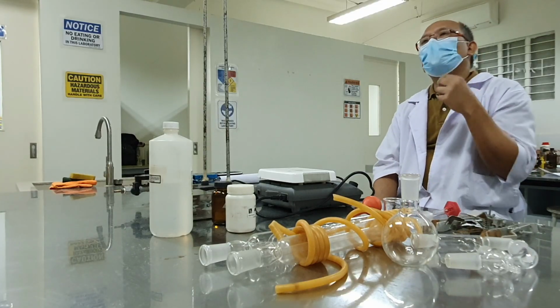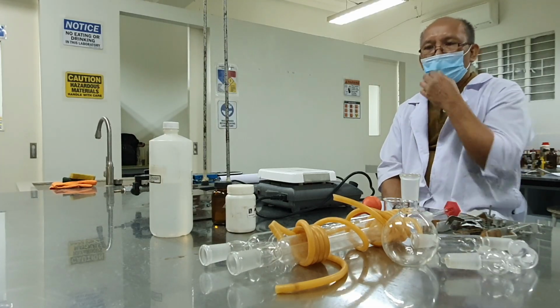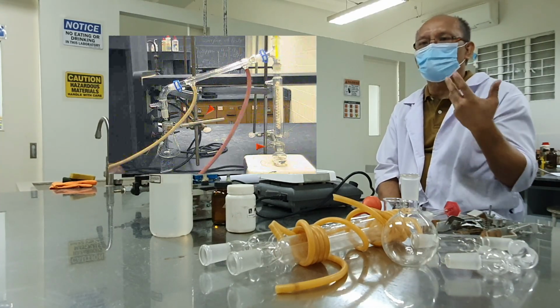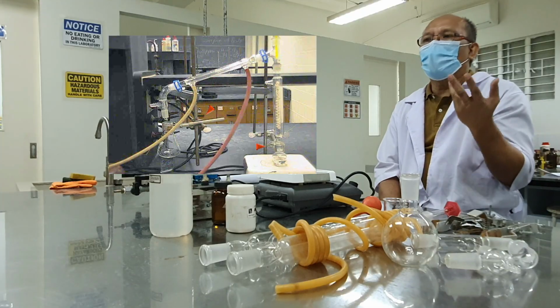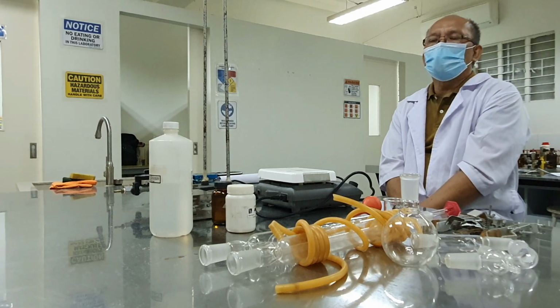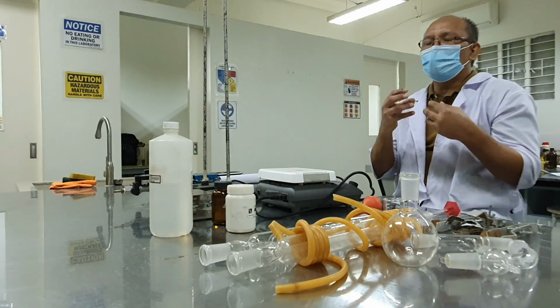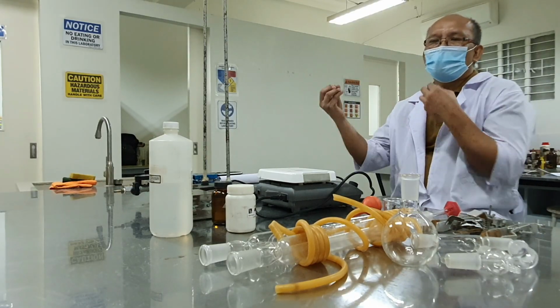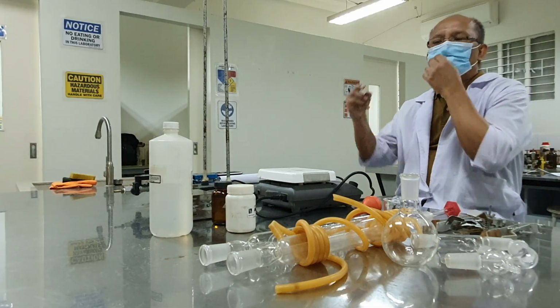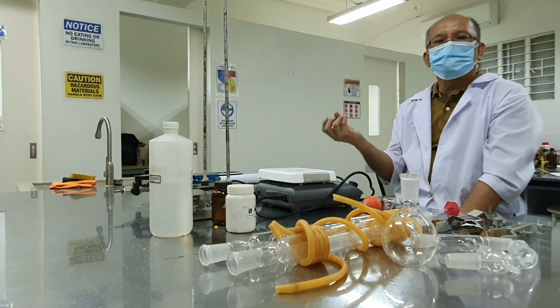There are two types of distillation: simple distillation and fractional distillation. What's the difference? Fractional distillation is a multi-simple distillation setup, and the product will have a higher purity compared to simple distillation. In a simple distillation process, once you receive the distillate, it is not actually pure yet. You have to do the second round, the third round, the fourth round in order to increase the purity.